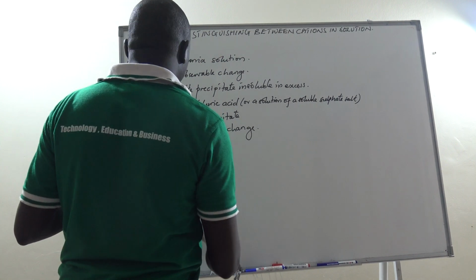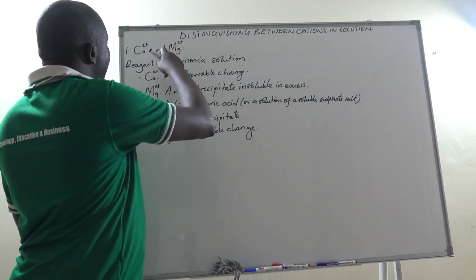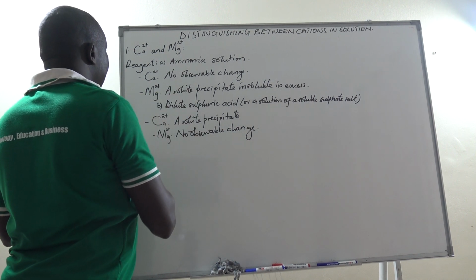That's why we get no observable change. In other words, no precipitate forms. So I don't want you to be able to forget this. And these are the two suitable reagents.